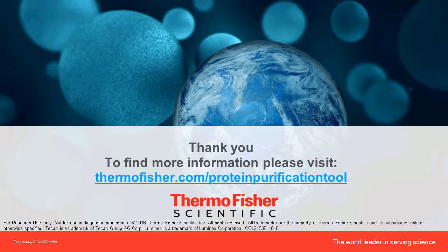With the mass spec assays, it varies. It's a much broader range, but we are still working out those details.